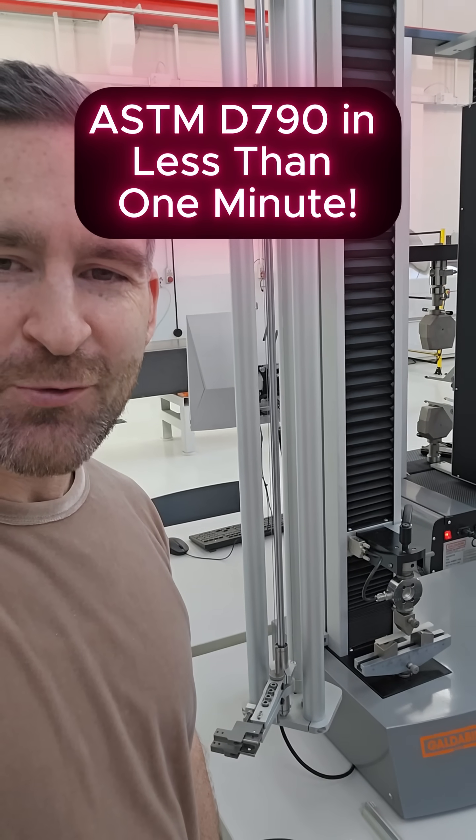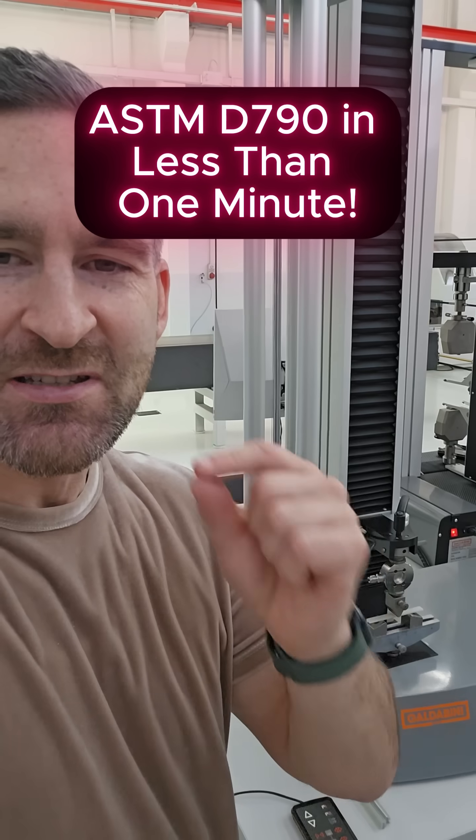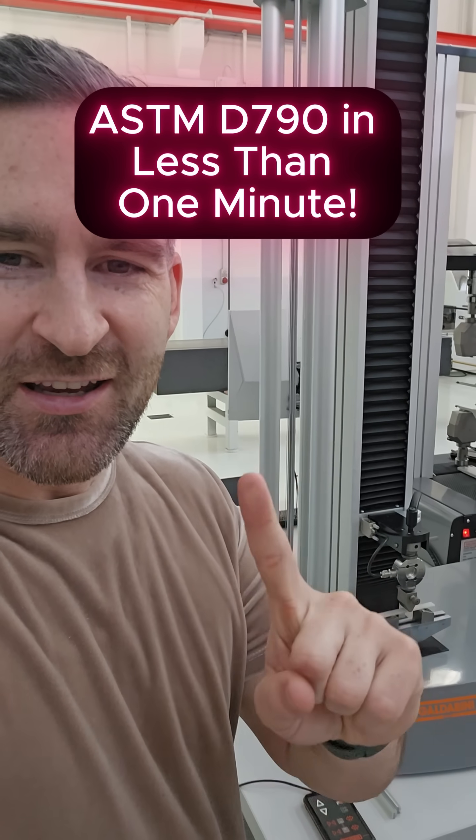Hello, today I'm going to show everything needed to conduct ASTM D790 in under one minute.